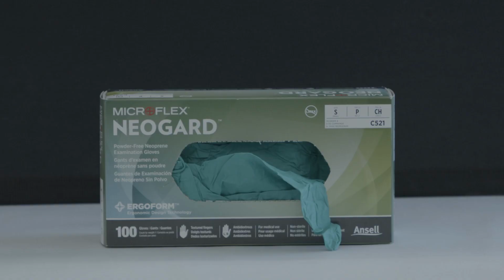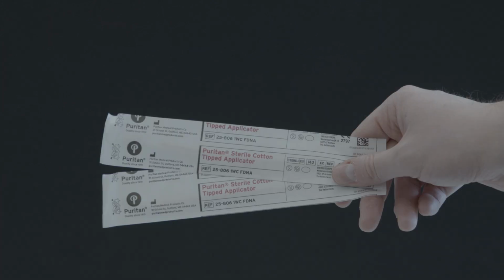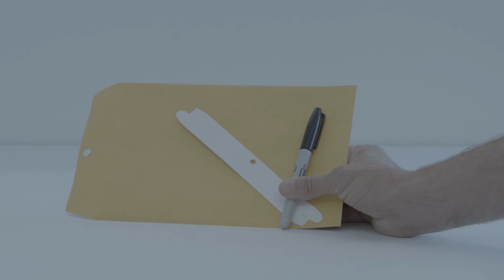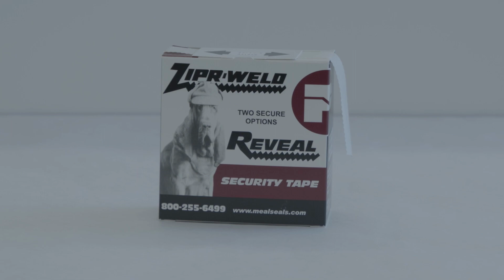You will need to gather a few items before collecting known DNA samples for casework. Clean gloves, 2 packages of single-use cotton tip swabs, preferably DNA-free swabs. If DNA-free swabs are not available, sterile swabs are also okay. Swab box. External packaging materials, markers, and evidence tape.